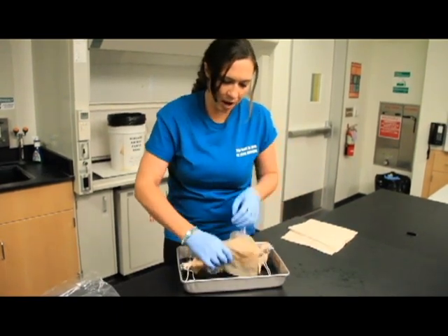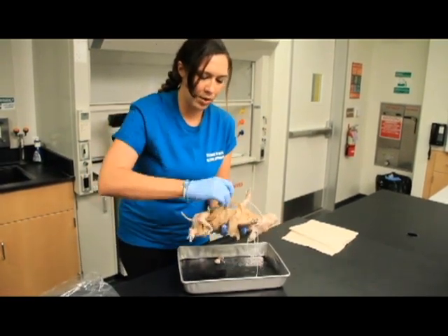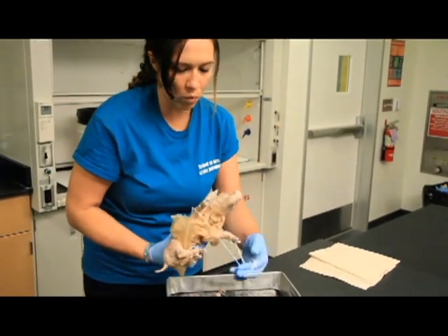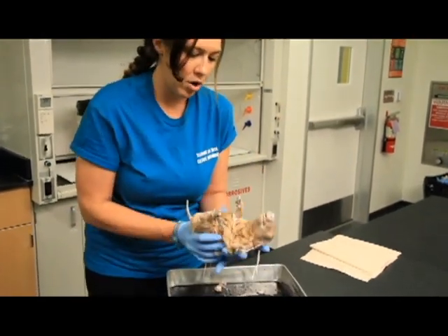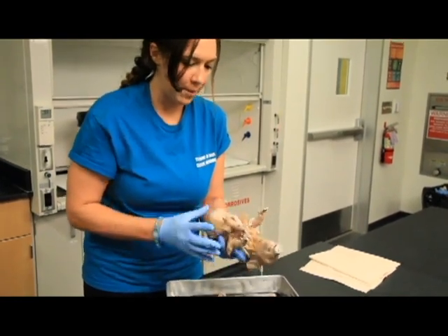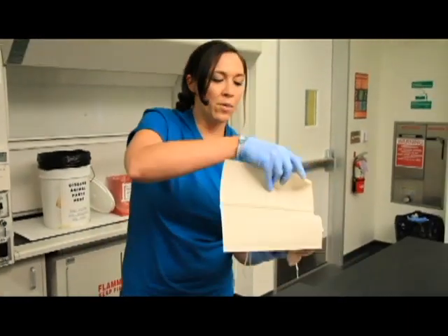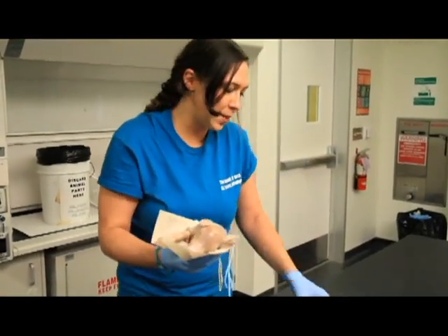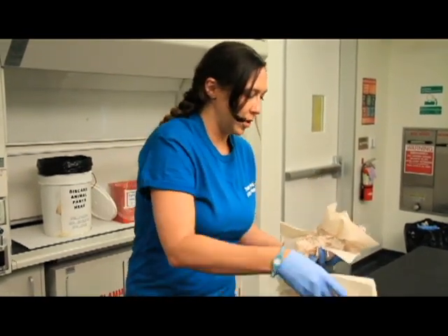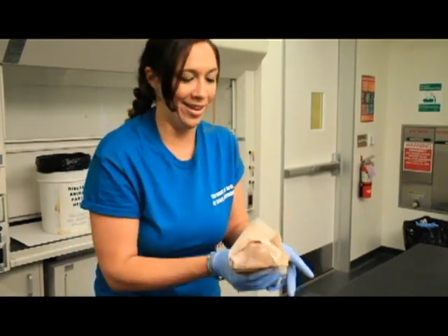And then once I get him covered just like this, I take the strings and almost wrap it around him. The key is to keep him nice and closed. Again, we don't want anything drying out or starting to rot, so we don't want it too wet, but we certainly don't want it too dry. So once you have him in this nice little pig ball, I wrap him again in even more paper towels. These paper towels can be damp or dry, it doesn't really matter. The whole point is just to keep him in this nice, closed, almost pig in a blanket.